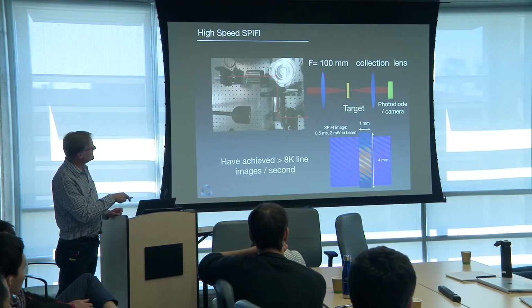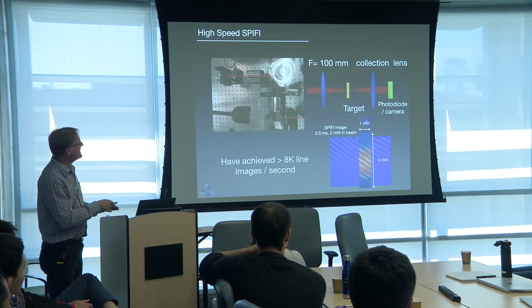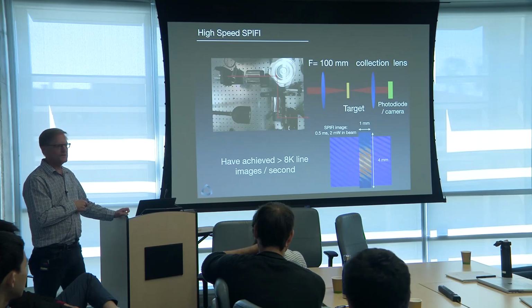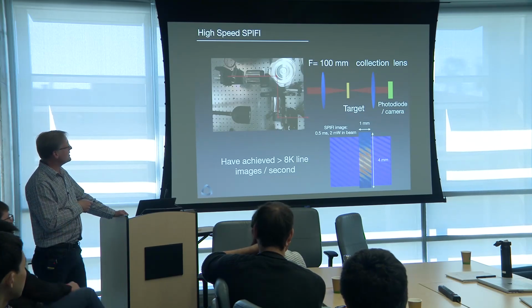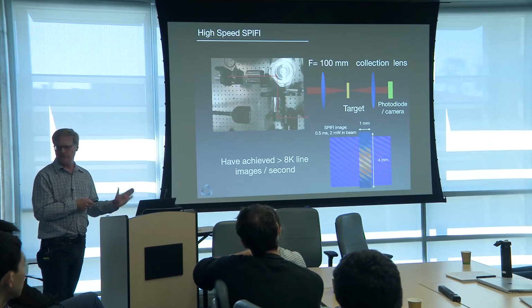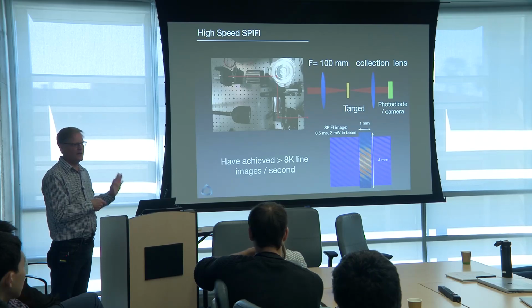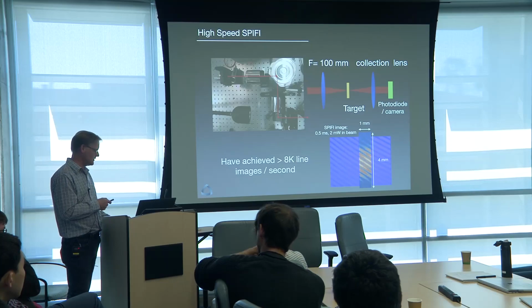And you can see we've got a larger field of view, and what I did is I cropped it. So that's how far we got in half a millisecond. We're getting really good rates at this point. It turns out I'm using the polygonal mirror as slow as it can go, so we can go faster with it. But it really looks like for this system, we're projecting out, we should be able to do 100 frames per second with this kind of system.